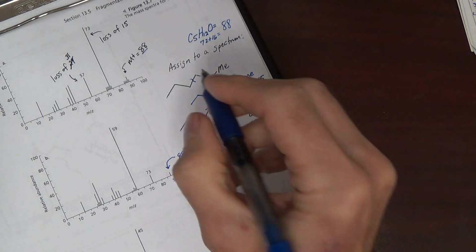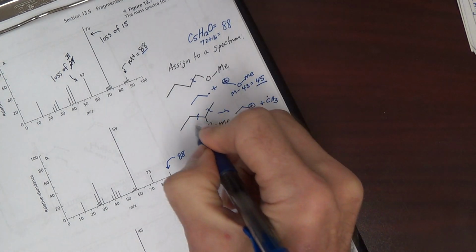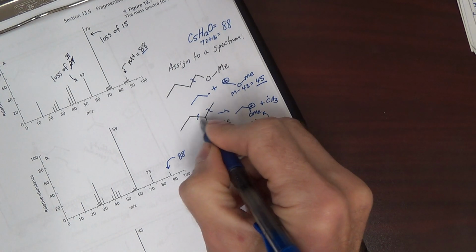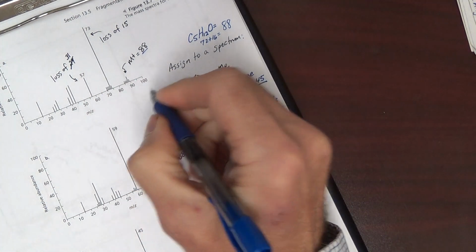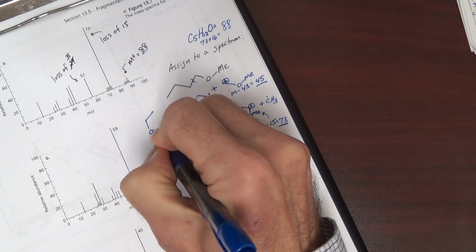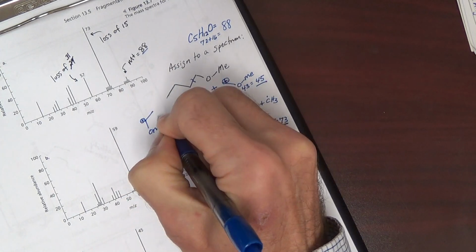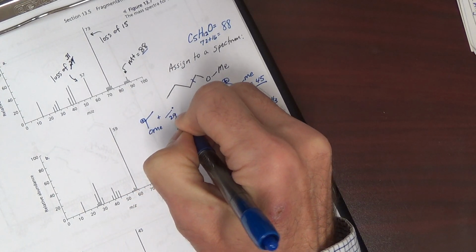We could also cleave on this side, or between this alpha and beta carbon. And that would give, I'll draw it over here, that cation plus the ethyl radical, and that's 29.